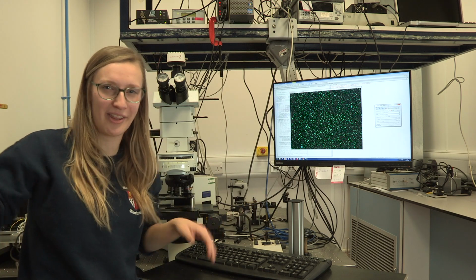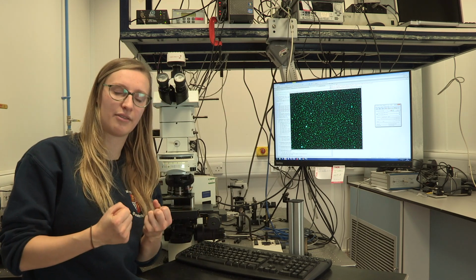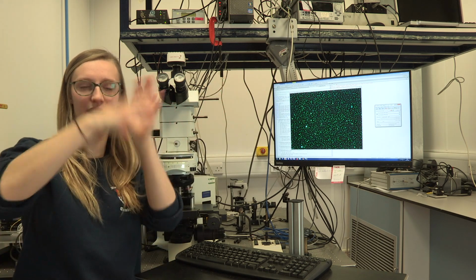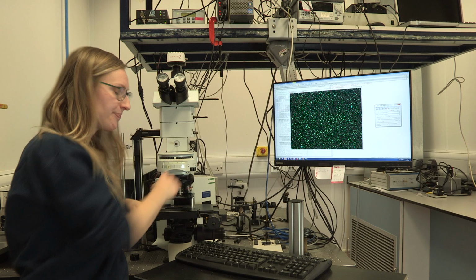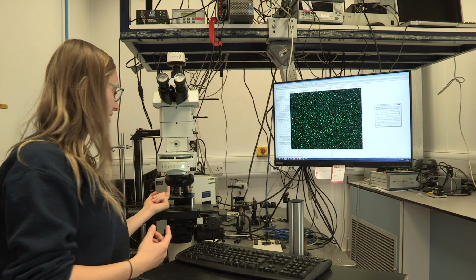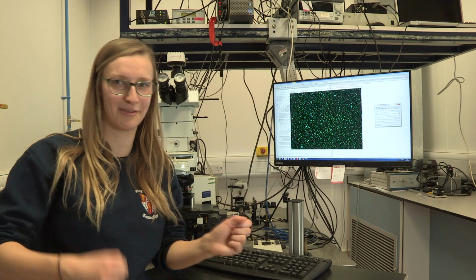All of the bonds shake and they also wag and breathe like this. And the effect of that is it takes some of the energy from the laser and then emits that as different colors of light, and it scatters in a kind of all-round direction. What we do here, so you have your lasers in the back and they come in through here, and then you put your sample down there. And then all of this scattered light comes back up through here, and you collect it as a spectrum. And what that tells you is exactly which bonds have been wiggling and vibrating.